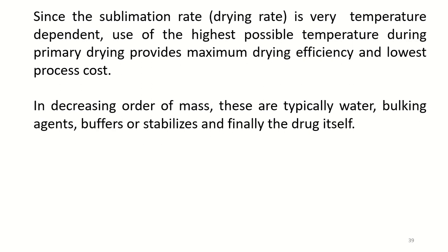In order to select the optimum drying temperature, it is necessary to understand the physical characteristics of the components used in the formulation that is to be freeze dried, in decreasing order of mass.